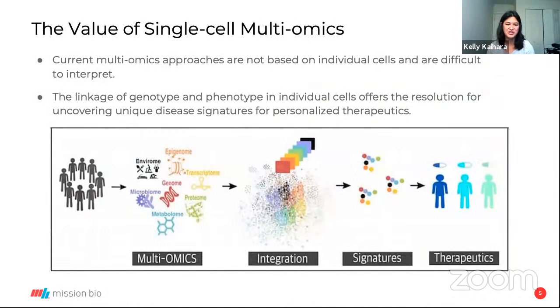So why do we want to shift towards multi-omics? Well, we want to get as much data as we can from very precious patient samples. Like I mentioned, we have many new cutting edge technologies, such as the epigenome, genetics, the microbiome, the proteome, the transcriptome.